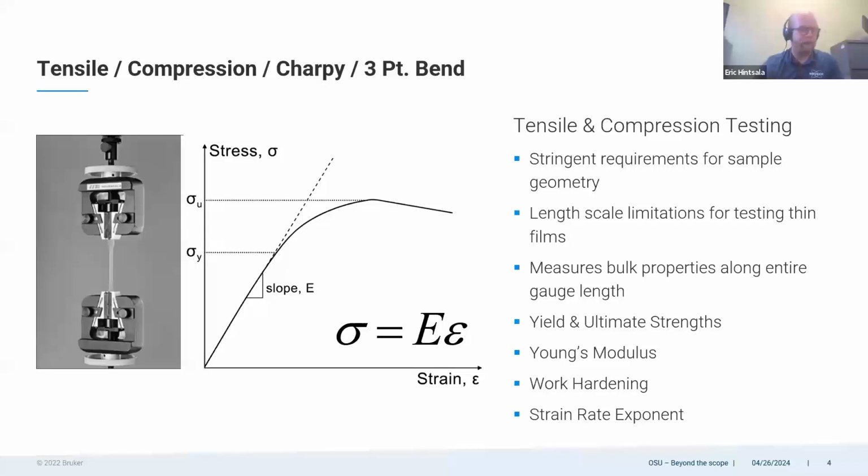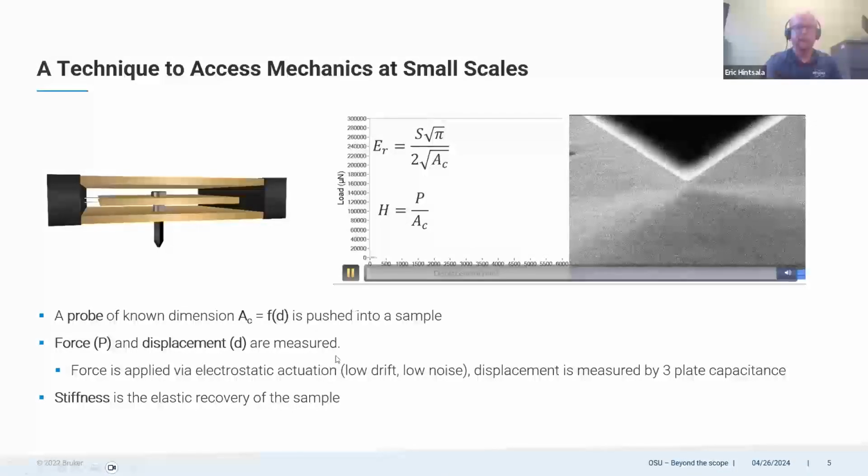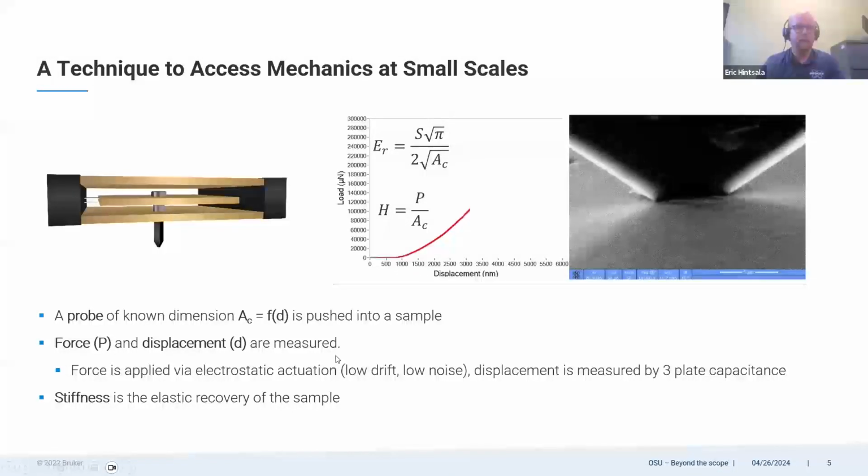And so, like I said, a lot of rich information. But when you think about another aspect of this, how long it takes to do this, if you consider the time to machine the samples as well, it's at least tens to hundreds of minutes per data point you're getting out of this. So it comes with a cost in terms of time. Whereas on the nanoindentation side, the tests run pretty quickly.